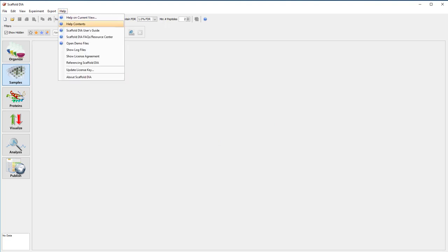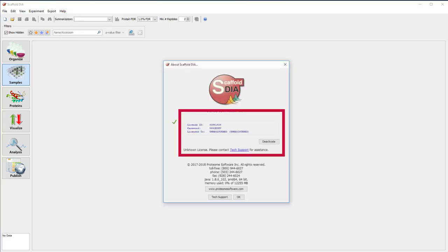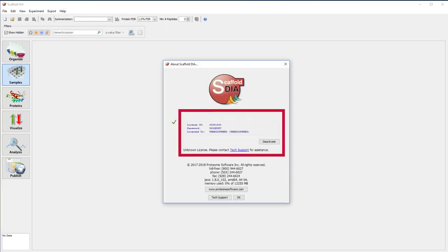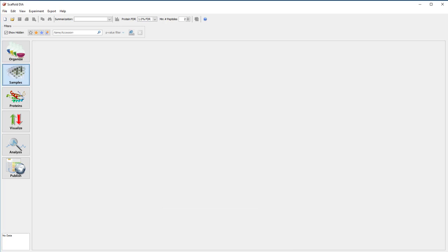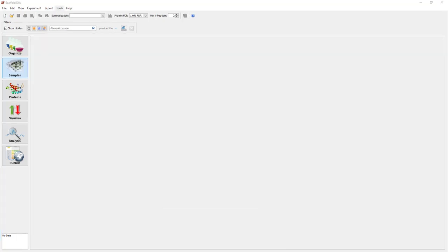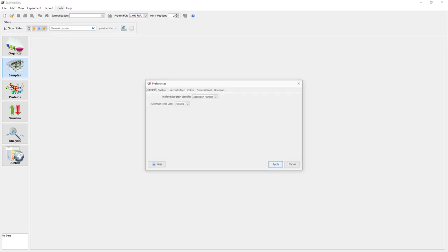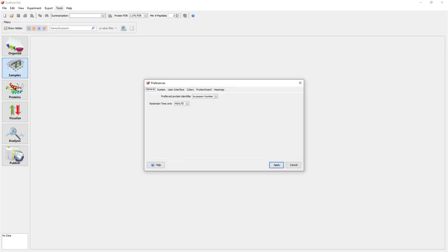To confirm your key is working, check the dialog access from the Help About menu. Finally, before you start processing data for the first time, it is a good idea to confirm your RAM and processor setting in the Edit Preferences menu.